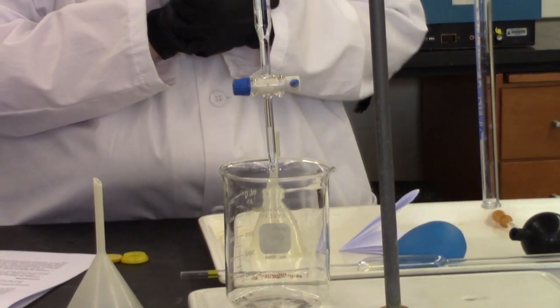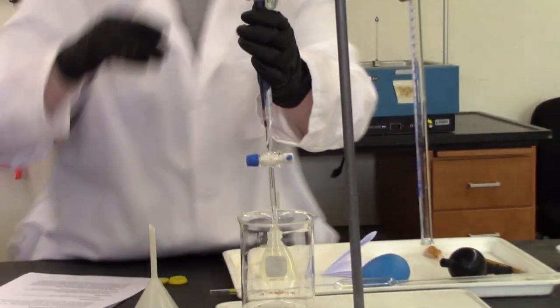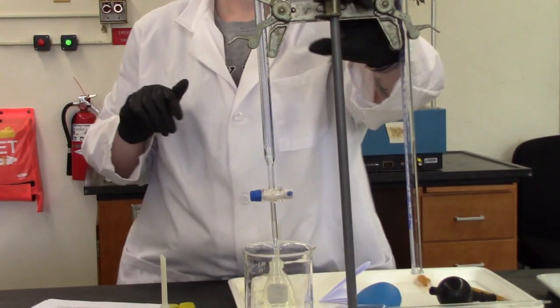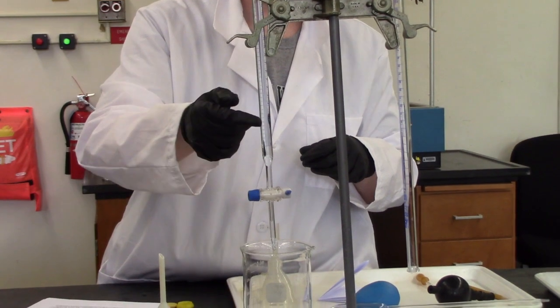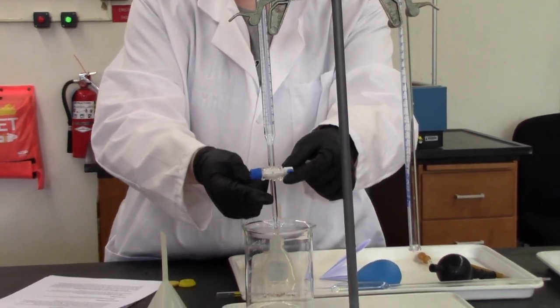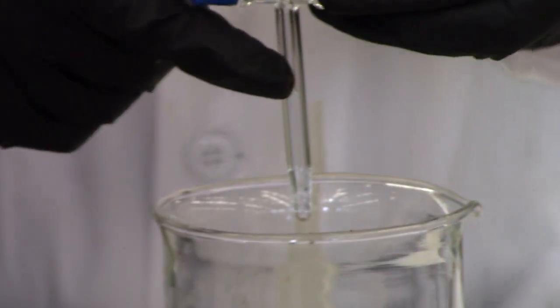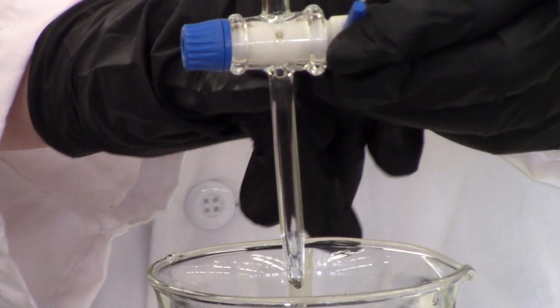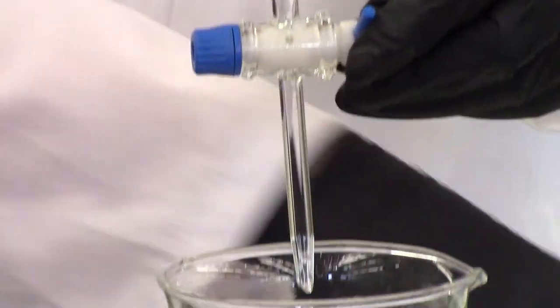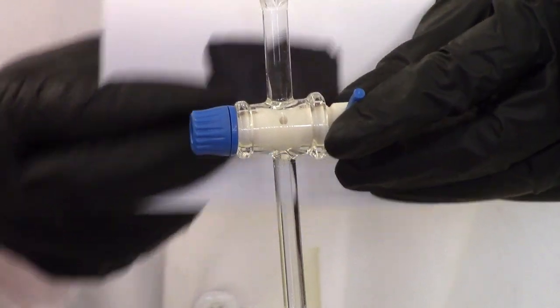And so all I'm going to do is not really pay attention to the volume at this point. This one's crooked. I'm going to open the valve so that the fluid passes through, and I'm going to try to get this bubble out. It can be tricky. All right, so are you zoomed in on this? All right, so some of the bubble came out, but you'll notice there's still some right up top right here. Maybe you can see it better like this. So there's a bubble stuck in there, and I want to get it out.